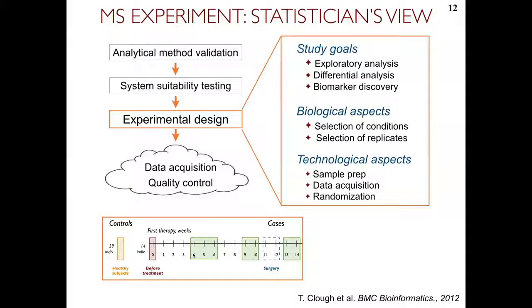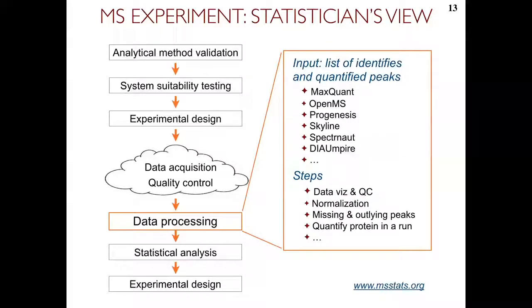The only really important constraint, or convention, is that in MSstats, each biological replicate has to have a unique identifier. So if you have person 1 in condition 1, and then person 1 again in condition 2, then we know that this is a paired design or a time course design. Otherwise, different groups will have to have different person identifiers. This is where we will essentially infer what type of design you have and how to deal with that. Okay, so that, and then the data processing.